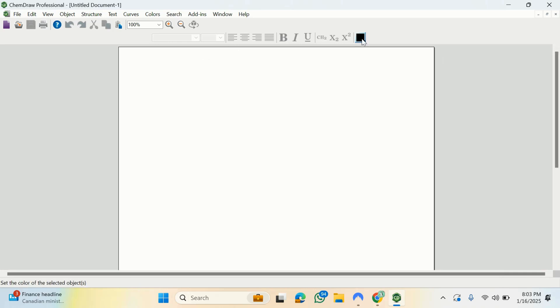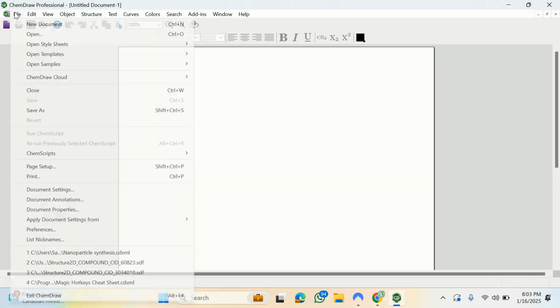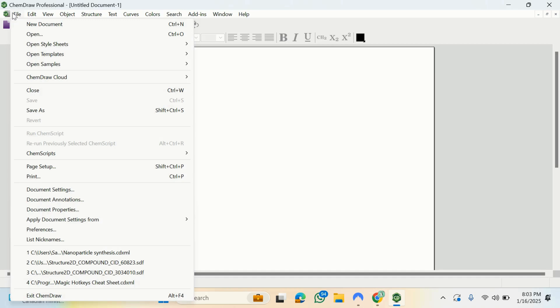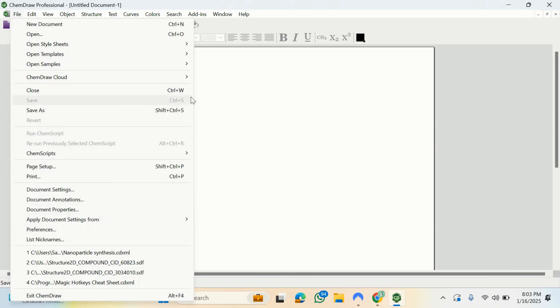When you launch the software, this is what you have — this is the interface of the software. Just like many other softwares, you have lots of options here to perform one duty or the other. The first one we look at here is the file. Just like in other softwares, you have your file where you can open your document, open your files, open sheets, and you can as well save from this particular option, just like you do in several other computational biology or computational chemistry tools.